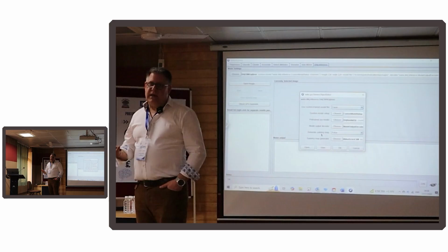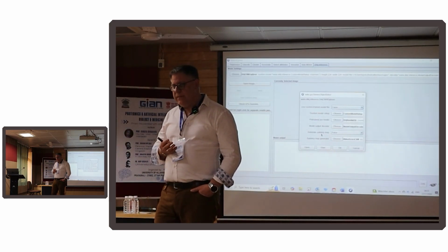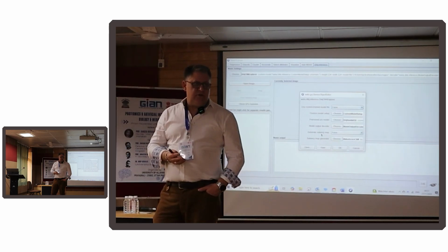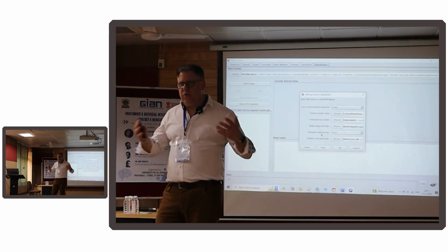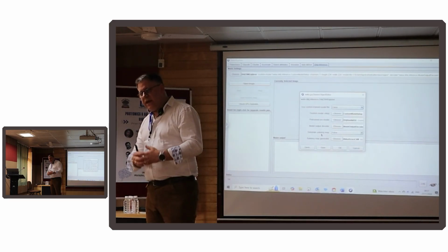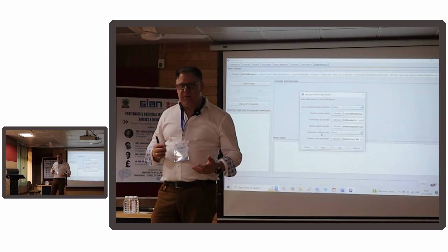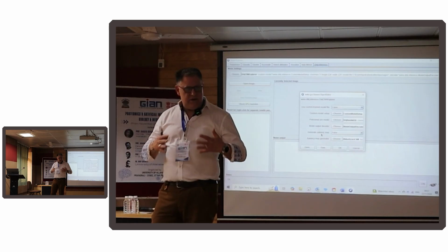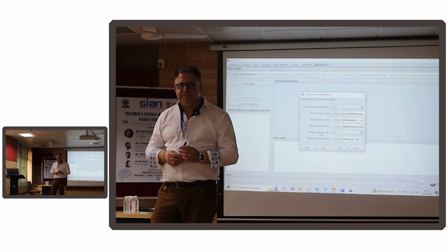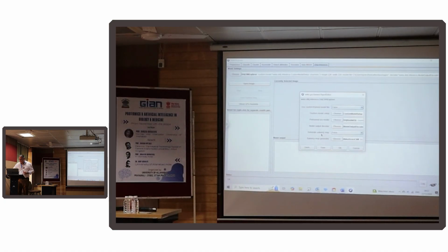So immediately you've got access to CNNs for analysis of images, allowing you to utilize them without coding them in Python, which people normally would. So that's a useful tool. Say you're looking at cell images, or even imaging mass spectrometry, potentially you could use CNNs on that. So that's another technique which is available in Weka.